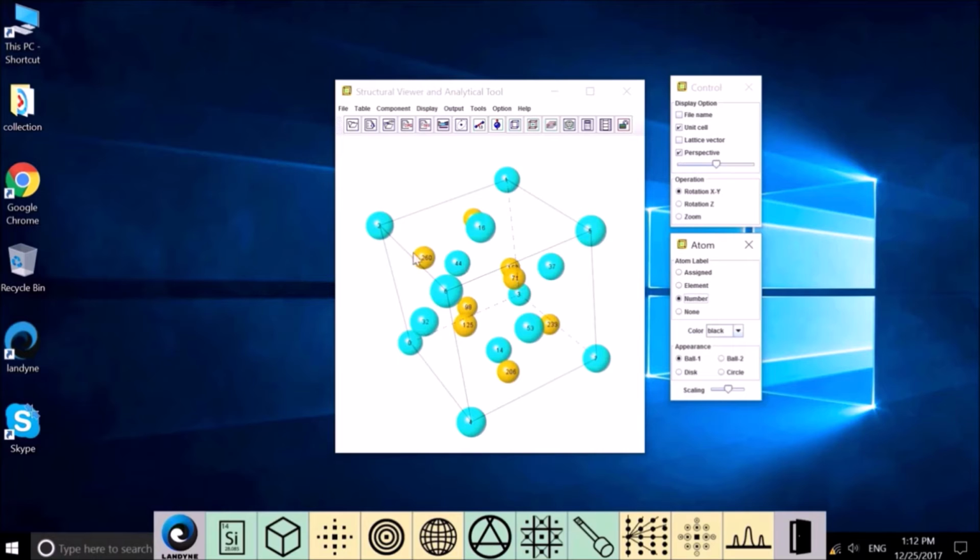Once later we want to connect the bond between the atoms, we have to use the number. And the next choice is nothing, just the color there. And for the label, here black, we can select a different color, like red, which will be more revealing for whatever we have for each atom.